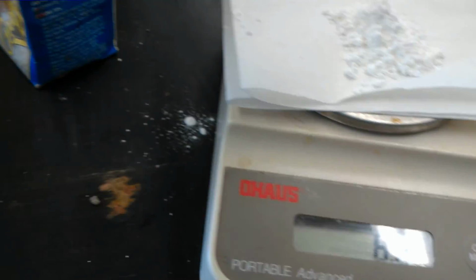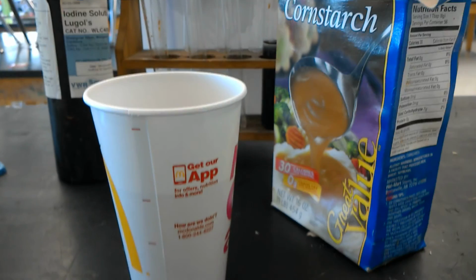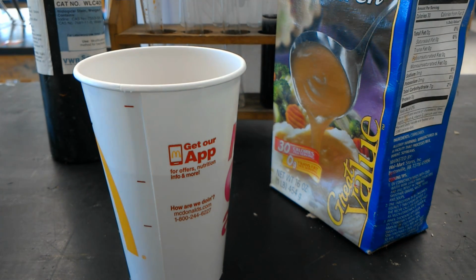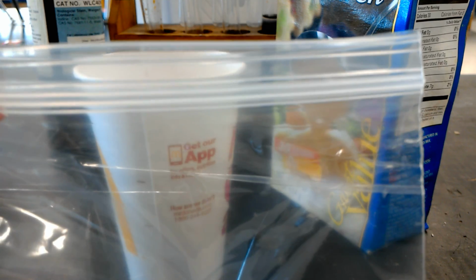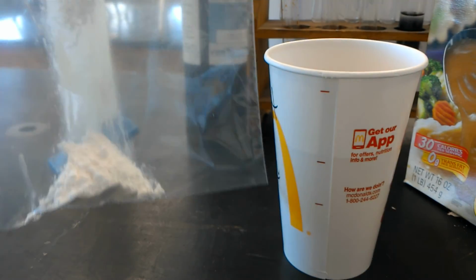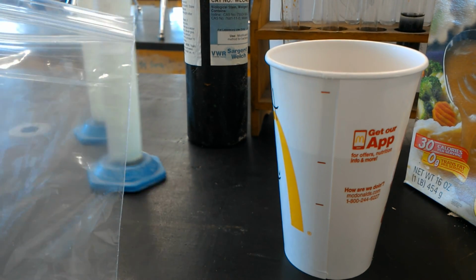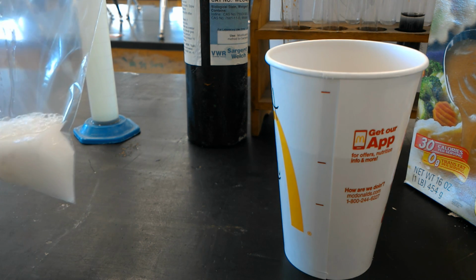So I got a little bit much. If I can take some off, 8.1. I'm going to call it a day with 8.1. It's not quite as crazy as if it was like 9.6. So I will then take my plastic bag, just a cheapo Ziploc bag from Kroger, and I will pour my starch in there. Pour my starch in the plastic bag. Okay. Then I will take 100 milliliters of water, and I will pour that on the starch in the bag.